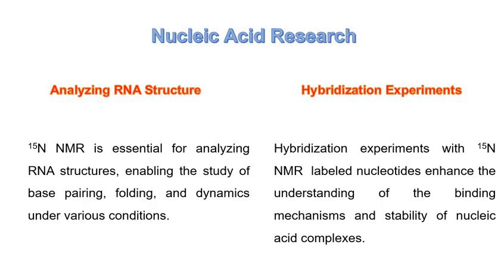Nucleic acid research. N15 NMR in analyzing RNA structure. N15 labeled RNA allows monitoring of nitrogen atoms in the RNA backbone and bases. NMR spectra help assign resonances to specific nucleotides, revealing their environment. Two-dimensional and three-dimensional NMR techniques like NOESY assist in determining spatial proximities of nucleotides.